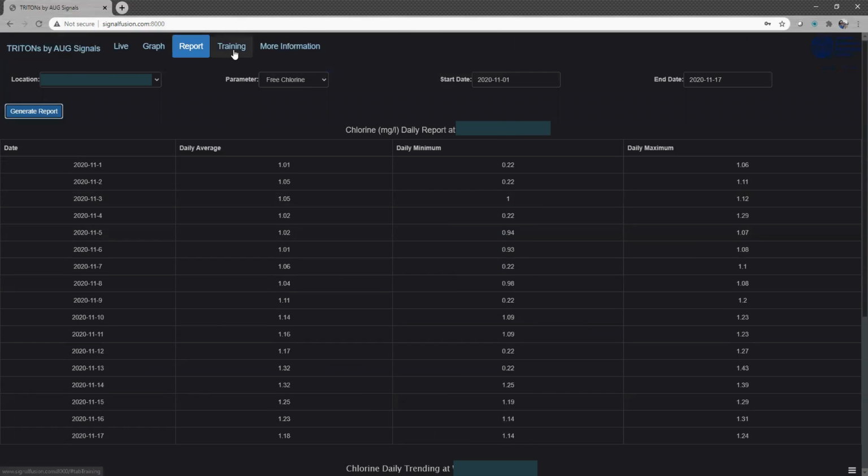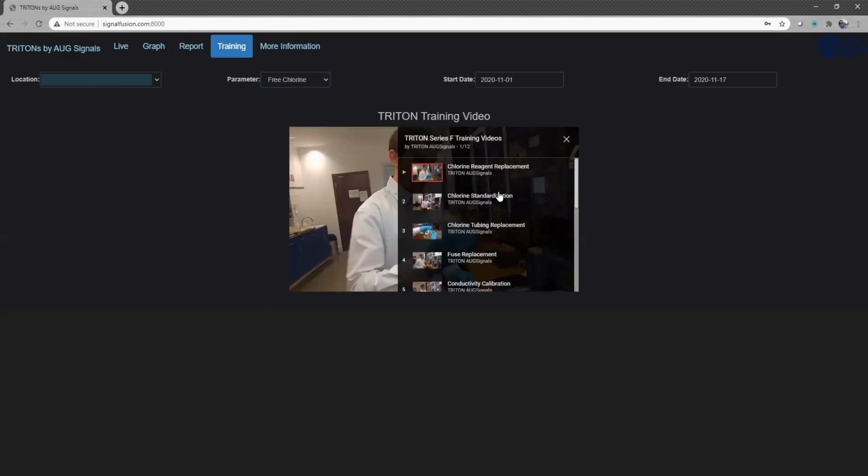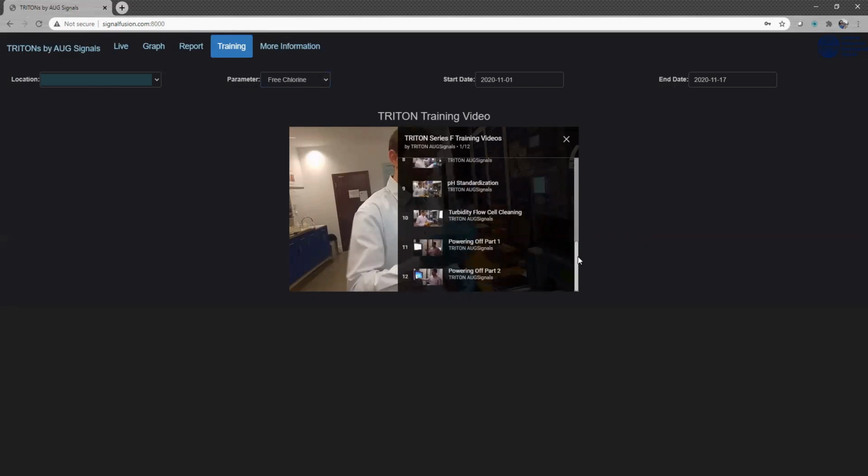Another feature here at the top is training. What this provides is a series of different videos made by AUG Signals to provide refresher courses for users who may be a little rusty with their Triton operations and maintenance, or perhaps the water plant has brought on a new operator and they're unfamiliar with the system. This is a useful resource for them because there are 12 videos here showing the most common routine operations and maintenance procedures.